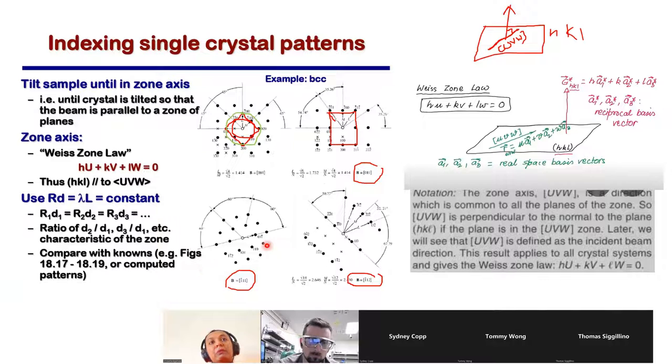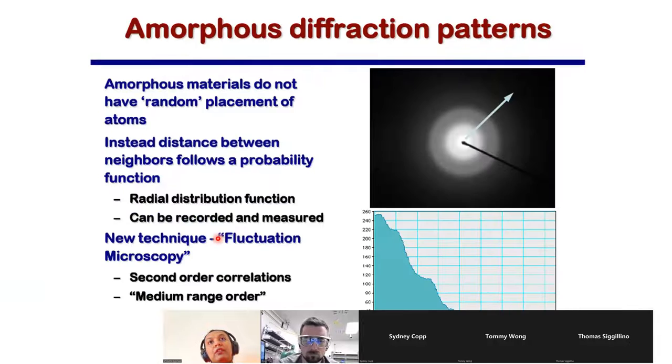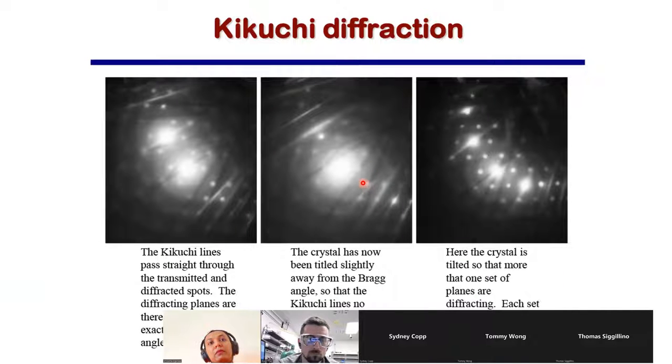But in other cases, this would be most tricky. And in this one, what you would see is a pattern like this. And once you see a pattern like this, you would ask why I'm not seeing a very good pattern. But in other cases, you will clearly see clear rings. It's very common that we see this kind of diffraction pattern and people can interpret very different information from it. Here you are seeing these spots, right? And you are also seeing some kind of rings which come from polycrystals because you are in a condition where your diffraction pattern is not clear.